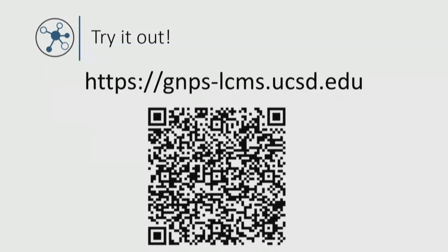Yeah, great question. This is kind of broader than the GNPS dashboard, and it's about having some spectra on hand. One of the tools that we built, if you went to the Beeman lecture last night, you would have heard about it, is called MASST. If you have spectra and want to ask, have I ever seen this spectrum before, specifically on Orbitrap instruments, you can ask that question broadly using the MASST tool to find it across all historical public data out there. Thank you.